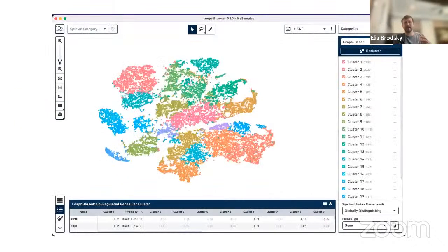Okay, so what are some standard tools that you will be running across when you are using your single cell RNA-seq data? What are some typical tools that you're going to be using? Well, typically, as I mentioned, a lot of the data is going to be coming from 10x Genomics. 10x Genomics have their own suite of tools, including Cell Ranger and the Loupe Browser, that allow you to analyze and explore your single cell RNA-seq data and make sense of them.